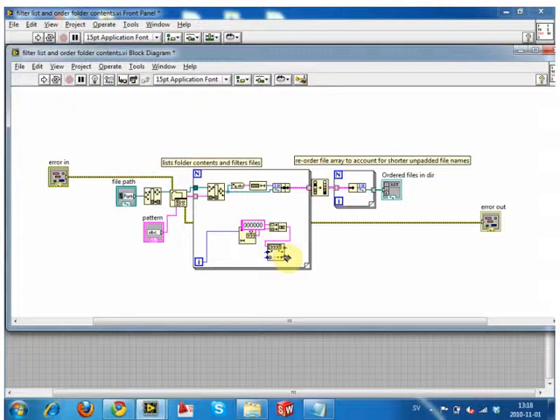This falls apart, so this does not work, if you say here we have 6 zeros but you had 10 million files, or 10 million loops of the cycle. After, or when it hits, 1 million, 1 becomes the first index and not 0, and the number of characters changes. If the number of characters changes, the numbering scheme is not going to work, because we're basing it on having enough numbers that we only fill up this set of characters. As soon as we go bigger than this set of numbers, it doesn't work anymore. Generally, you just pick a set which you'll never hit. I mean, 100,000 files is getting a little bit big, so that's a reasonable number to use.